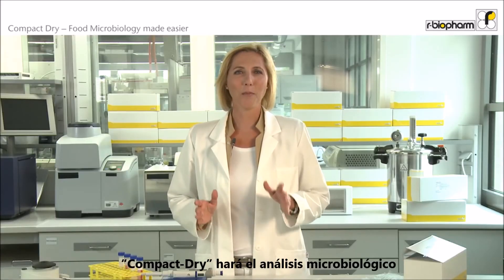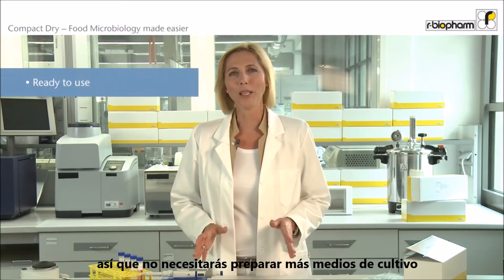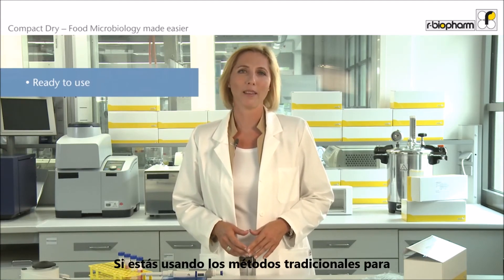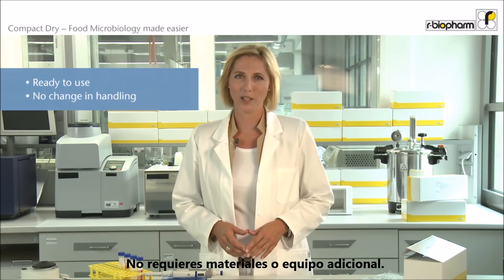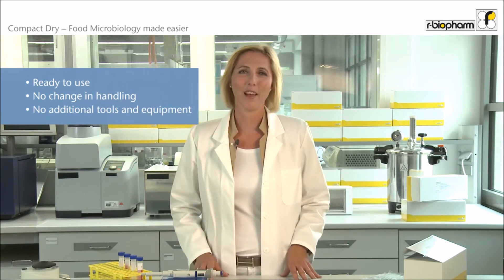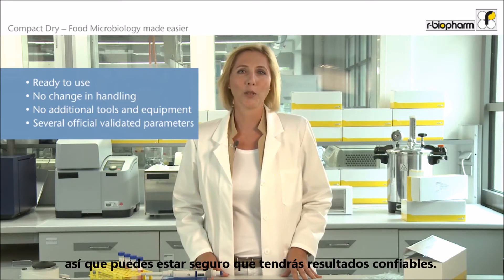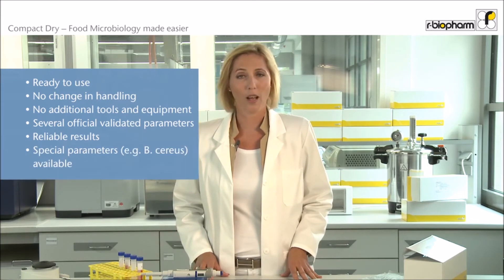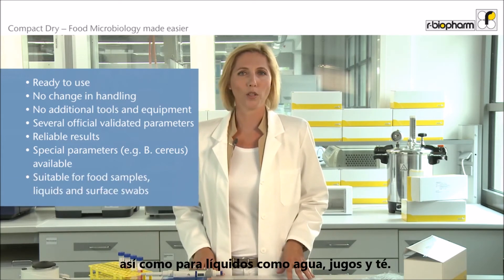Compact Dry will make food microbiology testing easier. It is ready to use, so no more media preparation or quality control of media. If you are using traditional microbiological methods, you can start using Compact Dry right away with no need for additional tools or equipment. Most Compact Dry products have been validated by official institutes, so you can be sure to get reliable results. The Compact Dry product range also includes target organisms that other manufacturers do not offer, and you can use it for testing food samples, liquids like water, juices, and tea.